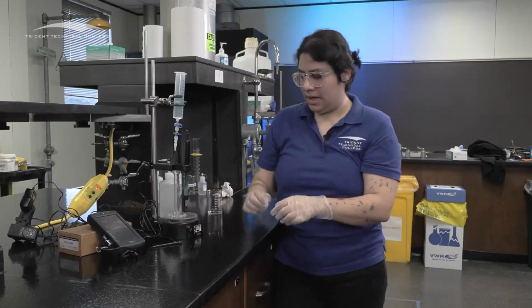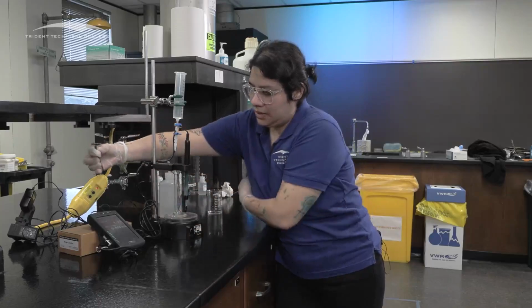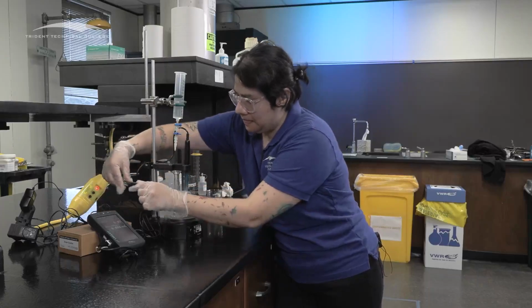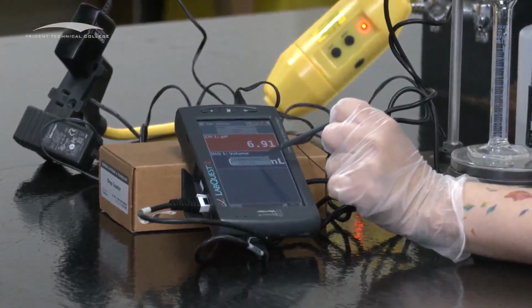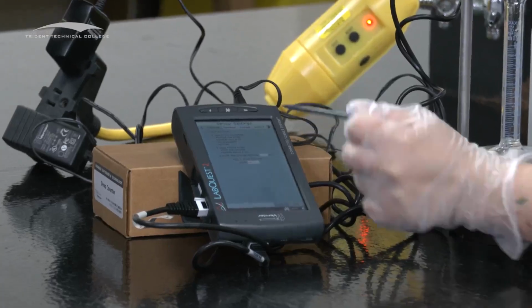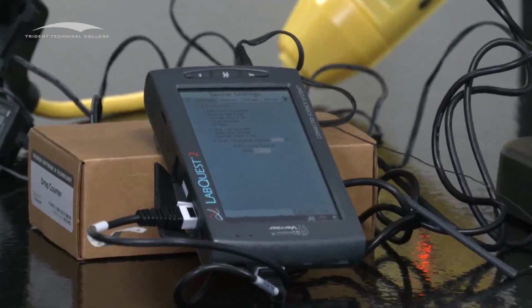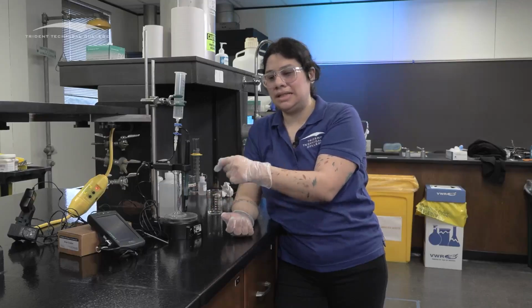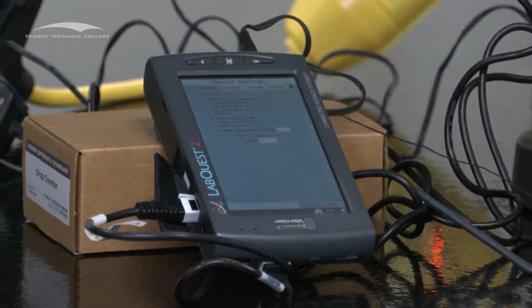And then whenever you're ready, you're going to click. You're going to go here, go to volume. You're going to hit calibrate. And then it tells you instructions. It says that you are going to put a 10 mil. You're going to go from here to here until you're about 10 mils. And then you're going to stop it. You're going to read exactly how much you have and put it in a box. The third box in there says how many milliliters did you use.